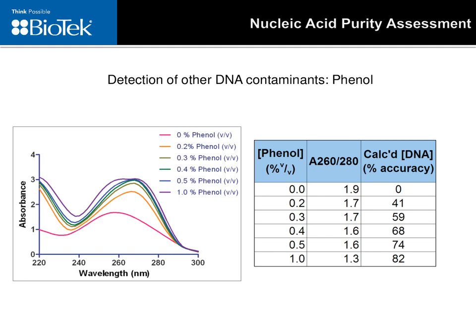Another question, when using PicoGreen, do we need to take measurements at two wavelengths, 480 and 530? So you're using 480 nanometers as your excitation wavelength, and then you're actually taking the reading at 530, which is the emission from that PicoGreen fluorophore.